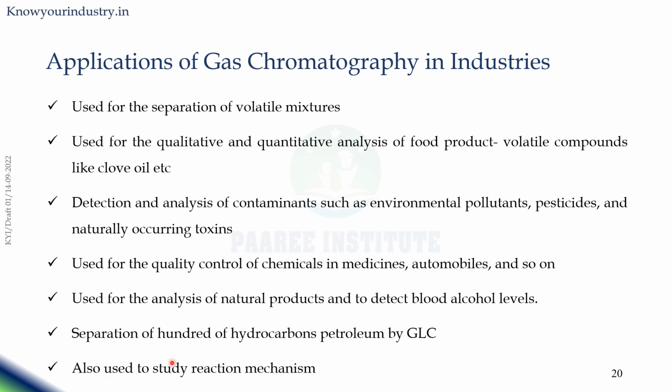And you can separate n number of hydrocarbons in petroleum by the GLC technique. It is also used to study the reaction mechanism of chemical synthesis or chemical processes.